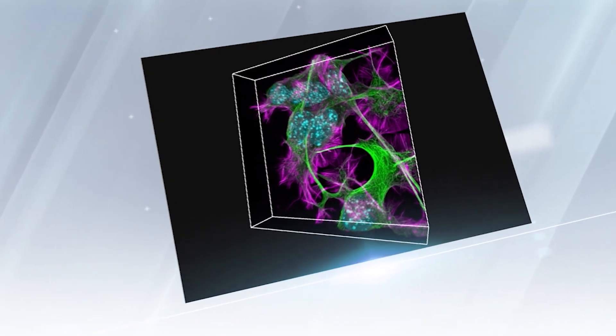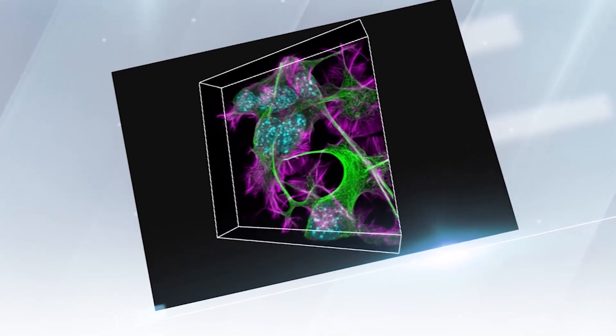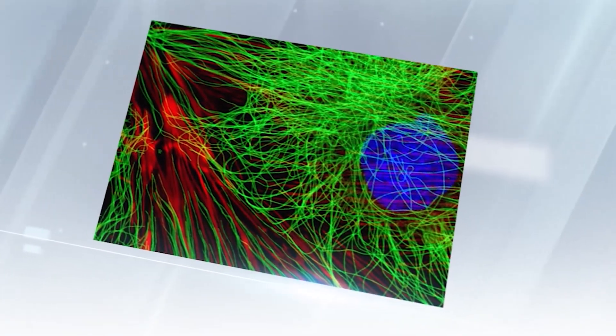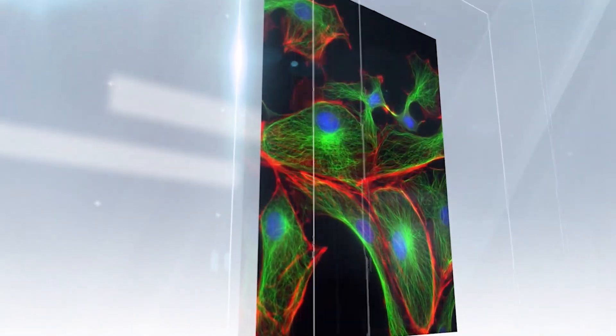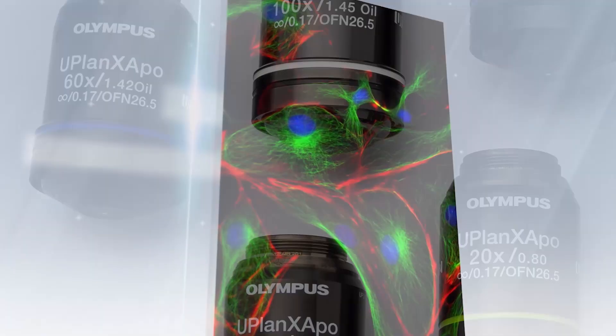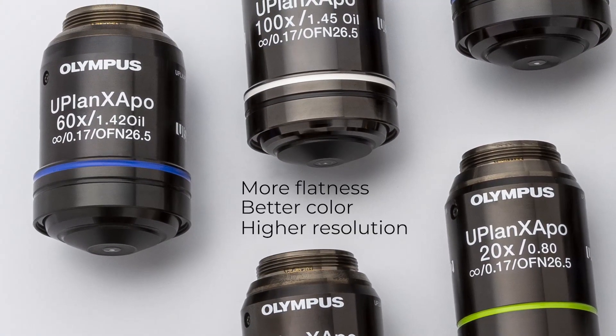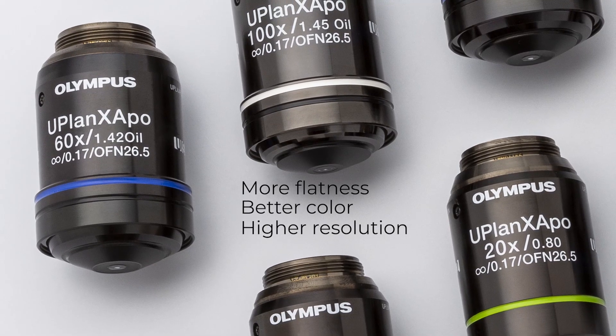Our X-Line objectives enable you to maximize your microscope's optical performance by minimizing aberration, so you can see a true representation of your sample without compromise. You can achieve more flatness, better color, and higher resolution simply by upgrading this single optical component.